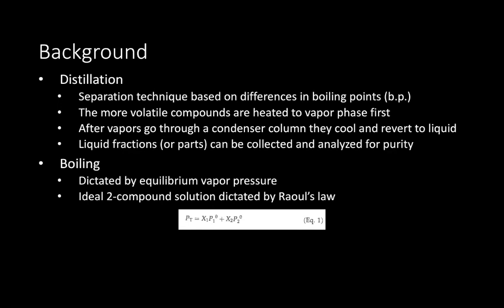A little bit of a reminder about boiling down here on the slide. It is dictated by equilibrium vapor pressure, and in ideal two-compound solutions, the vapor composition is dictated by Raoult's law, as you can see here. I'm not going to actually ask you to memorize these formulas or to even calculate vapor pressure or vapor composition based on any of the equations in the lab book.